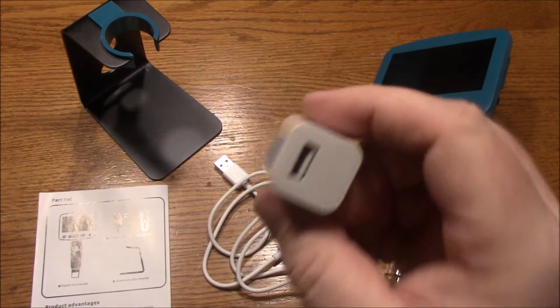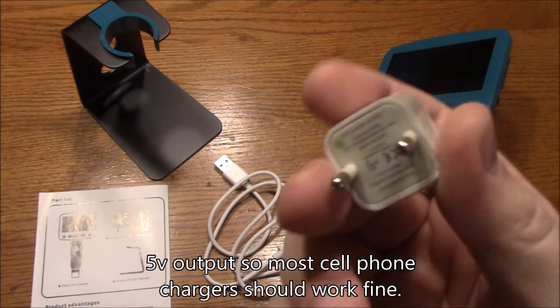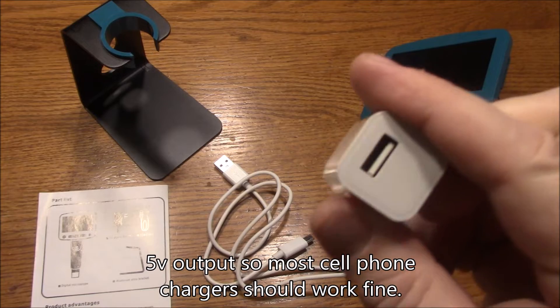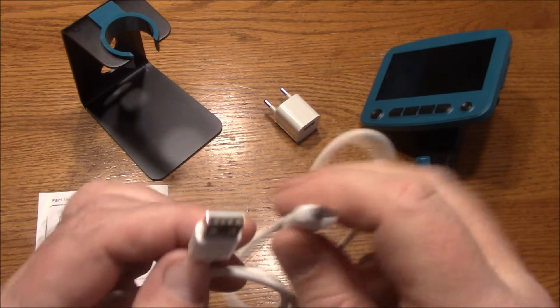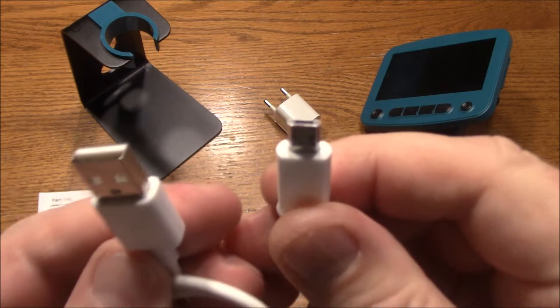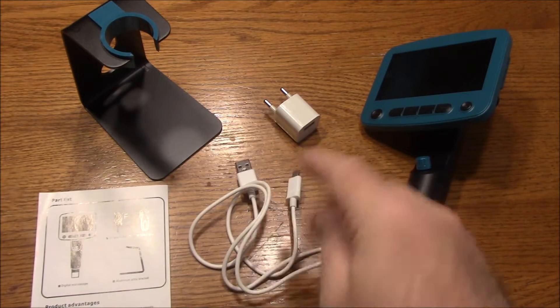Included with this is the USB 5V adapter, and it comes with a European plug. There is no option to change the plug, so this is just what you get. If you live in the US, you're going to have to use one that you already have. But the nice thing is it just uses USB to the little USB micro, so you should be fine. If you have cell phones, you probably have one of these.